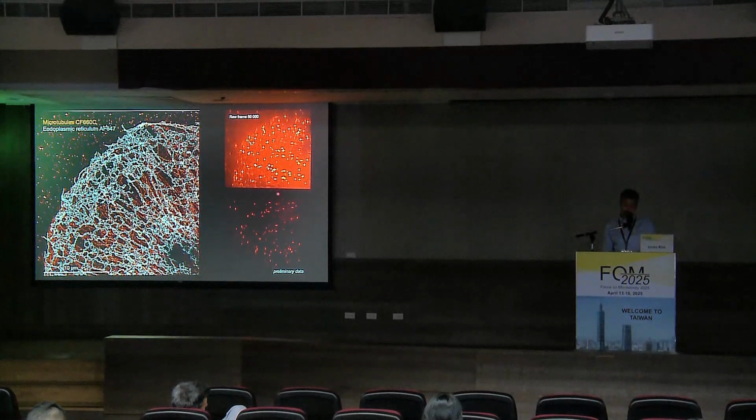Here's a dual color overlay. Yeah, you might say, you showed us much more pretty microtubules before. Why do you show us these crappy ones? The reason is not the imaging, the reason is the sample preparation. It took us about 3 months to carefully optimize the fixation to see both endoplasmic reticulum and microtubules at the same time. Because with most fixation approaches, you either see one or the other, which made us really understand how important proper fixation protocols are, and how easily you lose structures here. So we are quite happy with this result.